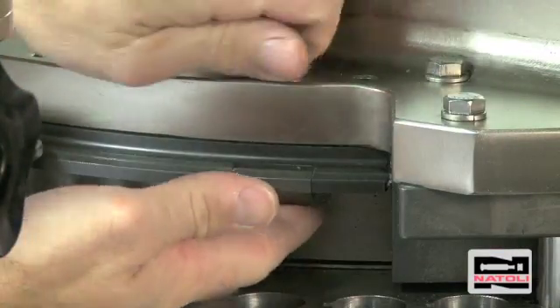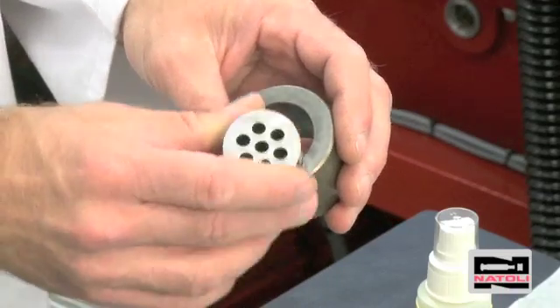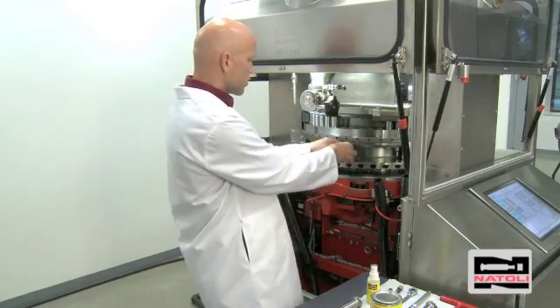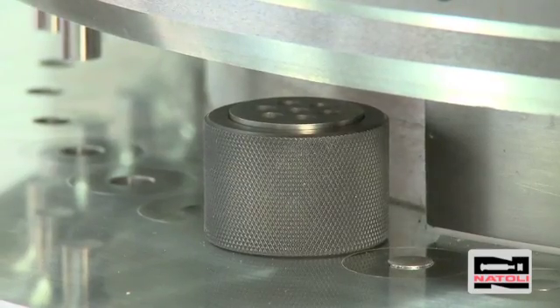Take a wrench and remove the upper punch takeout plate. Next, we take the die insertion ring, insert the die into it, and center it over the die pocket in the turret.